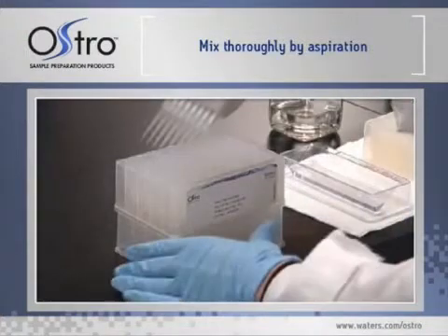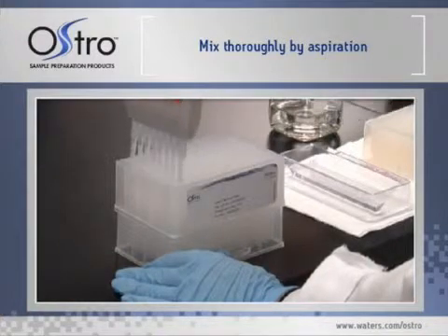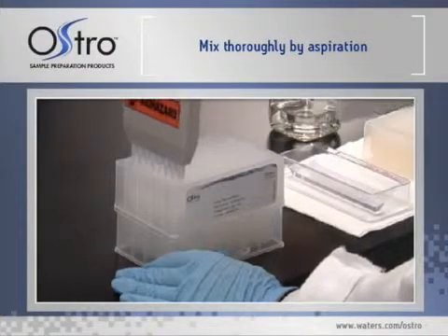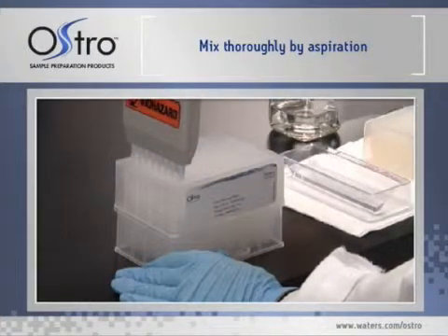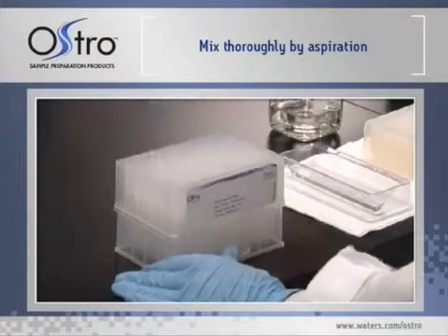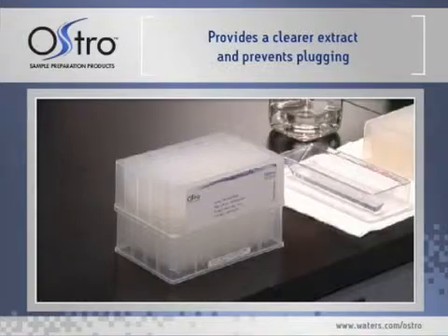Mix thoroughly by aspirating three times with a manual pipette or automated sample handler. Make sure that the pipette tips are properly positioned in the wells to avoid cross-contamination. We recommend aspiration rather than vortexing as a mode of mixing because it provides clearer filtrates and prevents plugging.